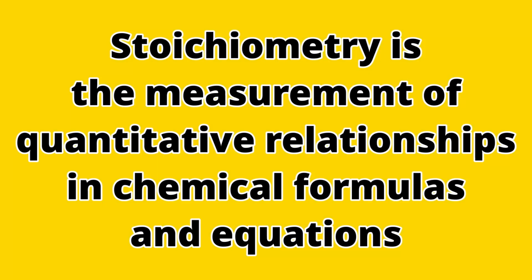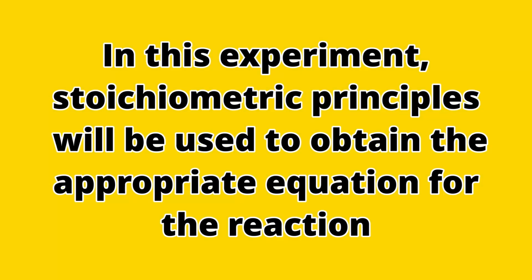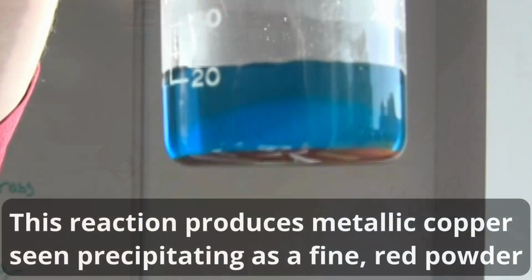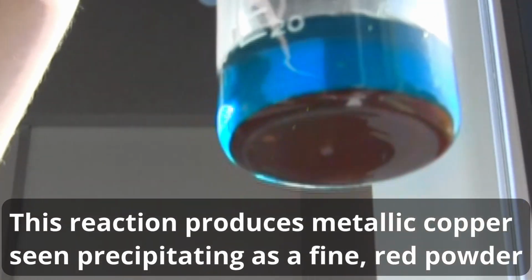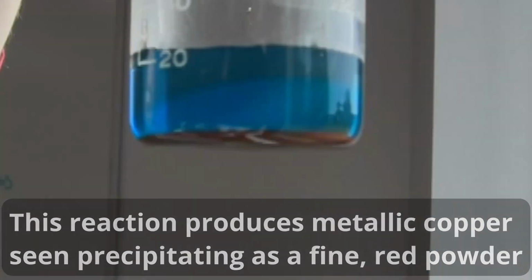Stoichiometry is the measurement of quantitative relationships in chemical formulas and equations. In this experiment, stoichiometric principles will be used to obtain the appropriate equation for the reaction between metallic iron and an aqueous solution of copper(II) sulfate. This reaction produces metallic copper, which is seen precipitating as a fine red powder.